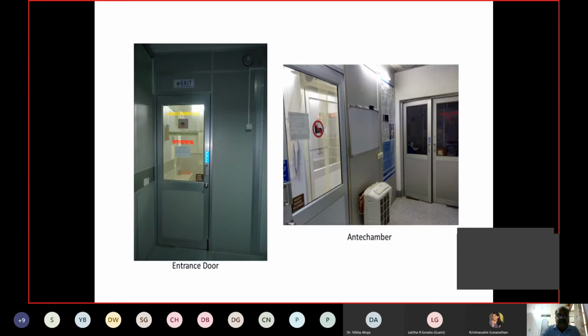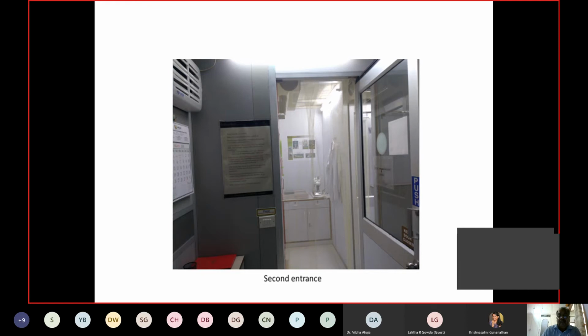The doors have to be double doored for making the entry restricted. And as Dr. Gaurav was telling, there has to be proper recording of the people coming in or going out after the work is over, and their timings and the kind of work, etc. Everything is noted in the register. There will be a place at the entry site where the detailed rules to be followed within the laboratory are placed. Everybody is supposed to follow the rules.